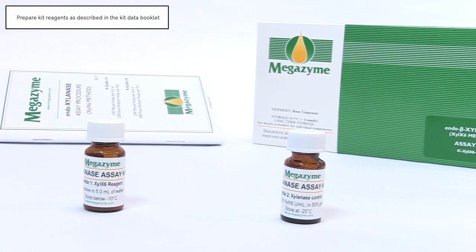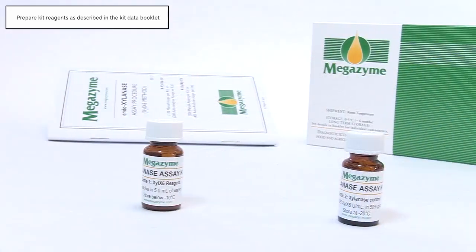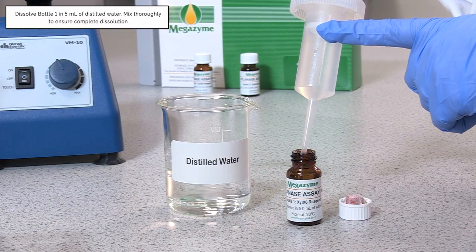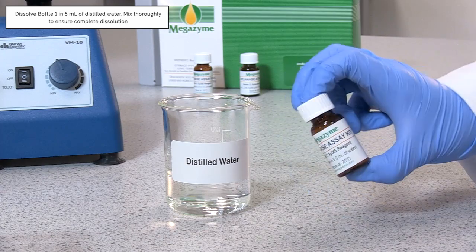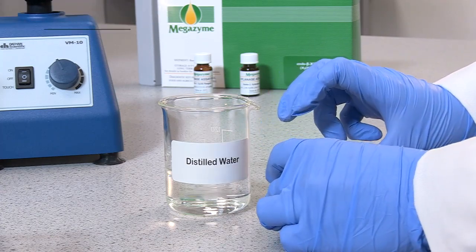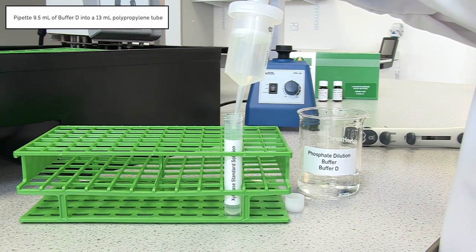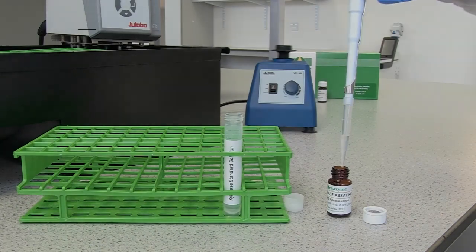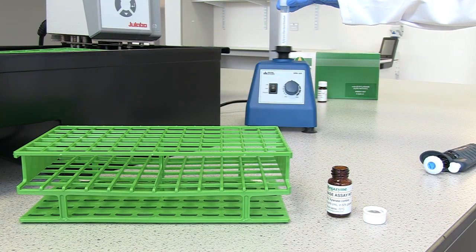Prior to sample analysis, the kit components should be prepared as described in the kit data booklet. Once prepared, they are ready for use in the manual assay procedure. The XYLX6 reagent is prepared by dissolving the contents of bottle 1 in 5 ml of distilled water. Mix thoroughly to ensure complete dissolution. Pipette 9.5 ml of buffer D into a 13 ml polypropylene tube, then pipette 0.5 ml of bottle 2 into buffer D and vortex to mix.